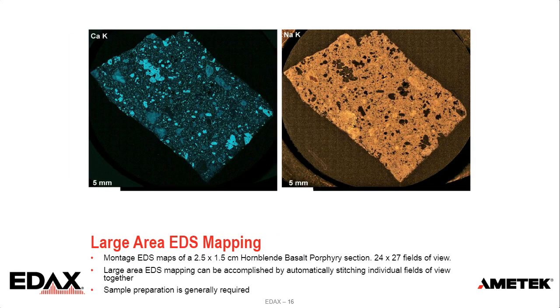On the SEM side, we can also do large area EDS mapping by using the montage option. Large area EDS mapping can be accomplished by automatically stitching individual fields of view together. This example is a 2.5 by 1.5 centimeter geologic section.